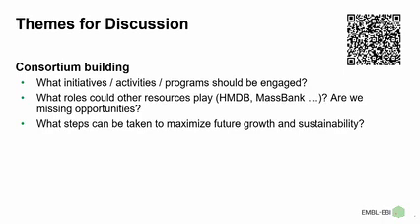Typically these standards and reference materials, by design, are pushed via agencies like NIST, or in Europe, the Joint Research Centre of the Commission. So for example, within the PARC project I mentioned, we are in direct contact with the JRC about what reference materials the JRC is going to create, and because there is a need on a regulatory level, they have to create them.